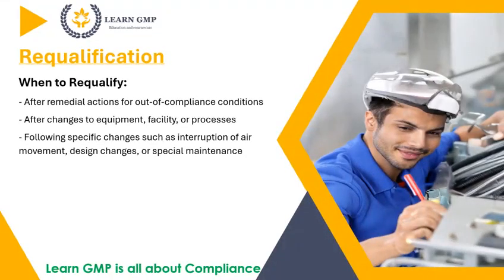When to requalify. After remedial actions for out-of-compliance conditions. After changes to equipment, facility, or processes. Following specific changes such as interruption of air movement, design changes, or special maintenance.